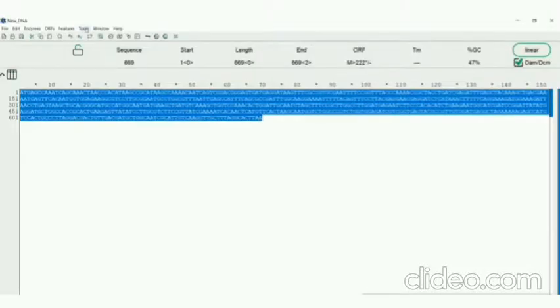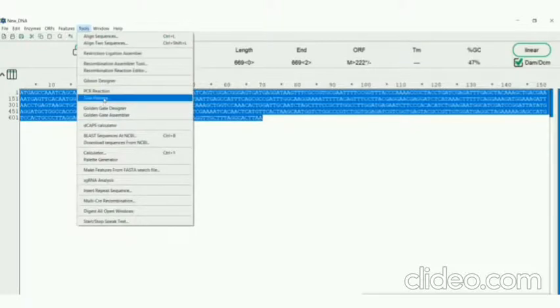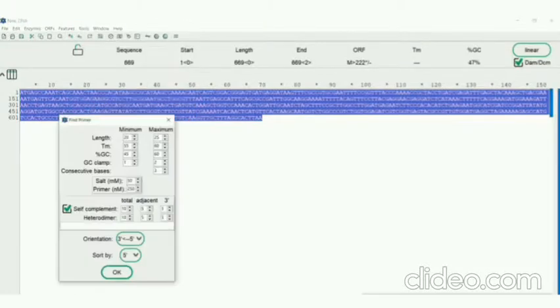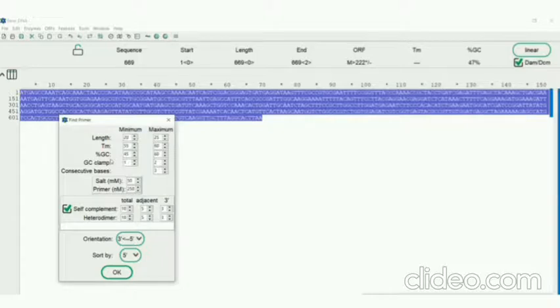To search for primers, go to Tools, then click on Find Primers. Now a window will be opened in which the user can change the parameters such as length, melting temperature, GC content, etc. Now you have to click on OK.